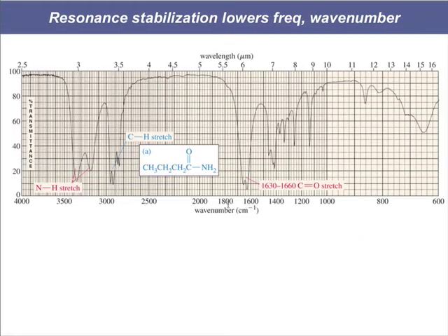So here's an amide, C double bond O, where the carbon bearing the double bond O has an N on it. We've got our CH stretches, our baseline, those are here, nothing surprising. Here's our broad peak from around 3300 with our two spikes. See those spikes there? That is typical of NH groups, which is our nitrogen group here. Since that nitrogen is on the carbonyl though, we end up with a very low carbonyl peak.